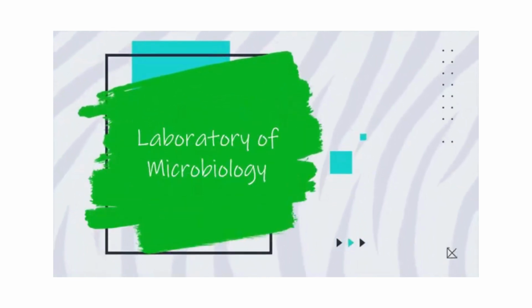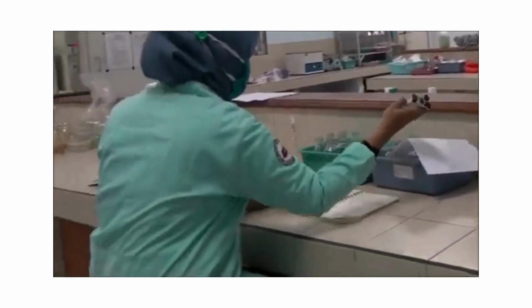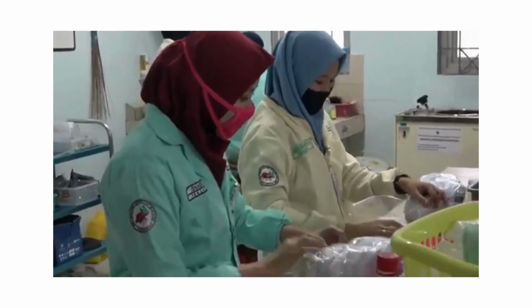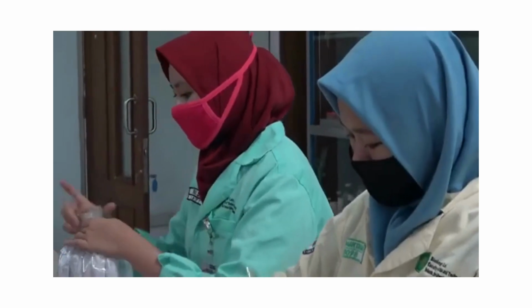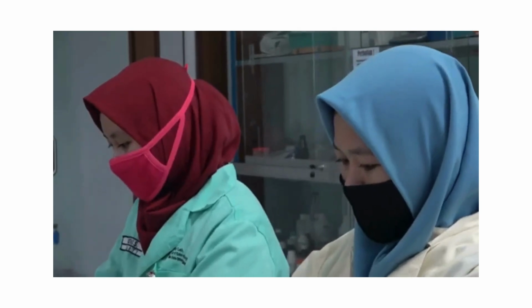Laboratory of Microbiology. The Laboratory of Microbiology is used in research and education in basic microbiology, environmental microbiology, application areas of health and food microbiology, mycology, and related subjects.